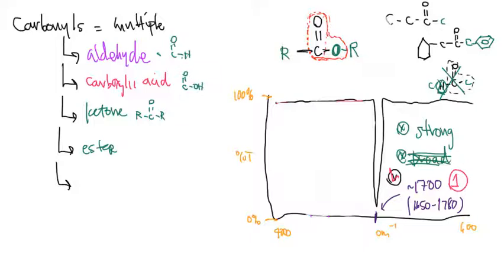So this is a ketone, this is a ketone, and we said that really couldn't be a ketone because there was a hydrogen on the other side, so we just crossed it out. If I wanted these to be ester functional groups, the only thing that I have to do is change that carbon to an oxygen and then write a carbon there. And this is the ester functional group that we see in organic chemistry. The same thing happens here. There was a carbon that was written there. If I just switch that to an oxygen and then have that ring hang over, that now is classified as an ester because it's a C double bond O, O.